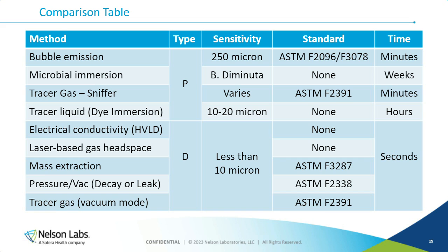I know that many years ago, pre-COVID, maybe 2018 even, there was someone who volunteered to start writing a standard for the electrical conductivity. I haven't heard anything about one being started for laser-based headspace, but I would imagine we'll see one. It's just a matter of getting a technical expert who's motivated to work with ASTM and try and get a standard.